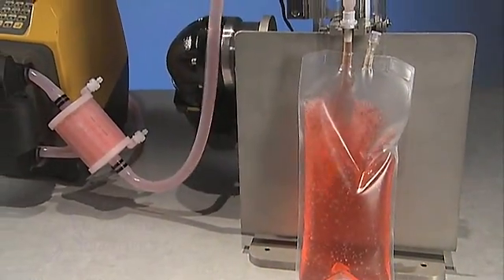Utilizing bags when packaging fluids can bring a multitude of benefits to your process. However, filling a bag can be a challenge.